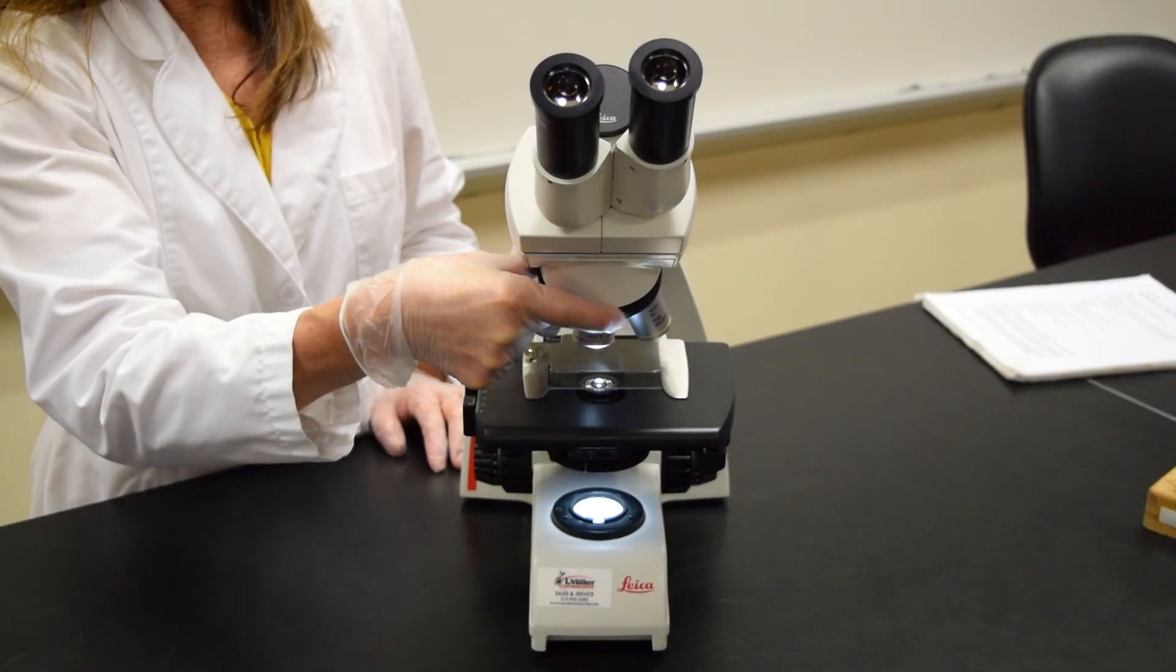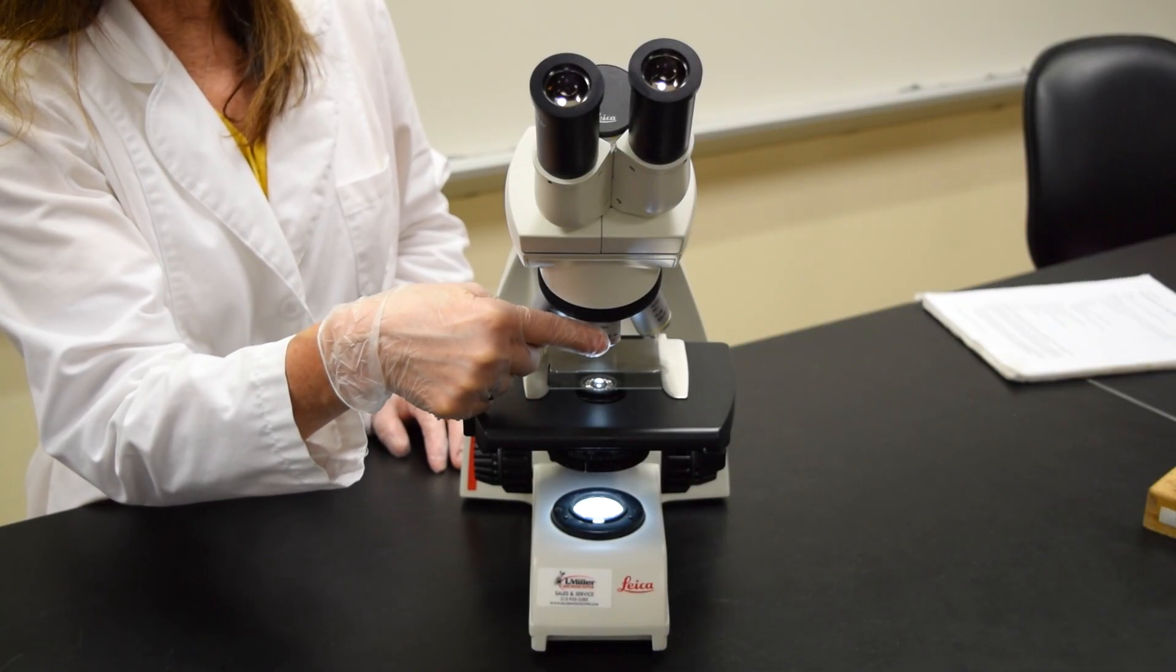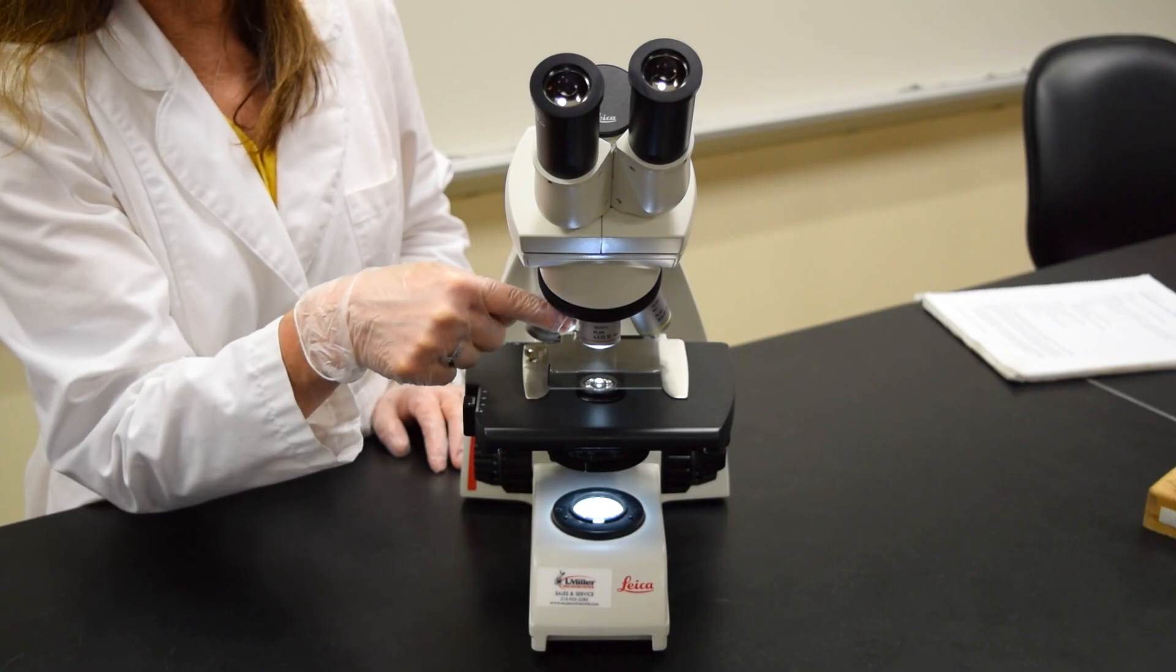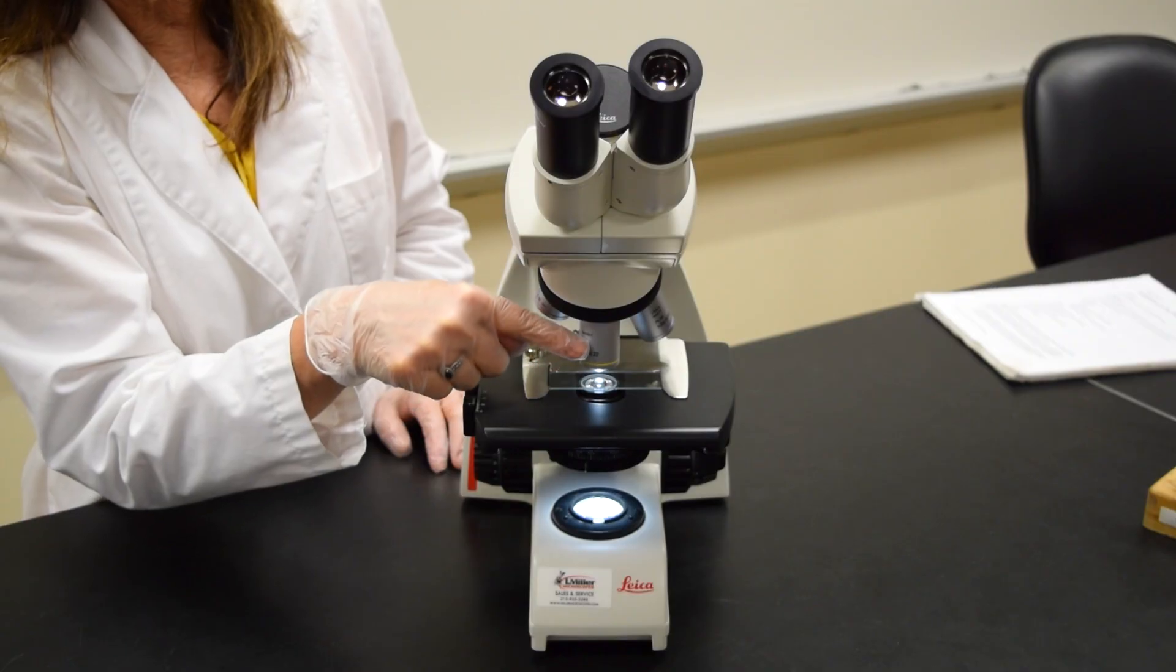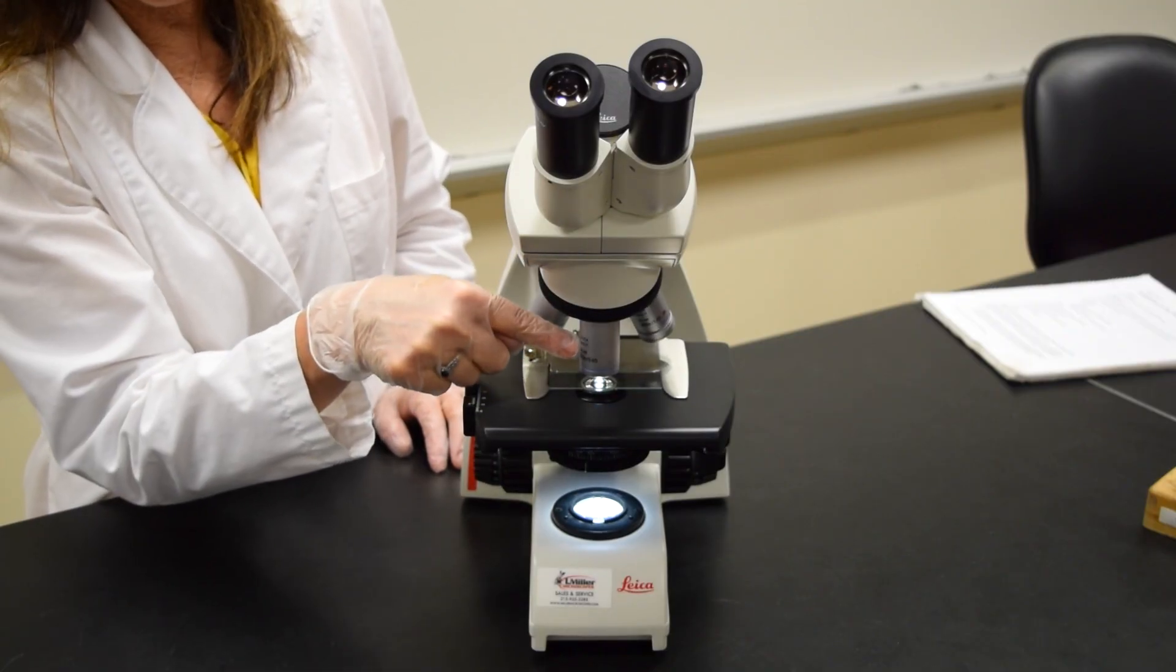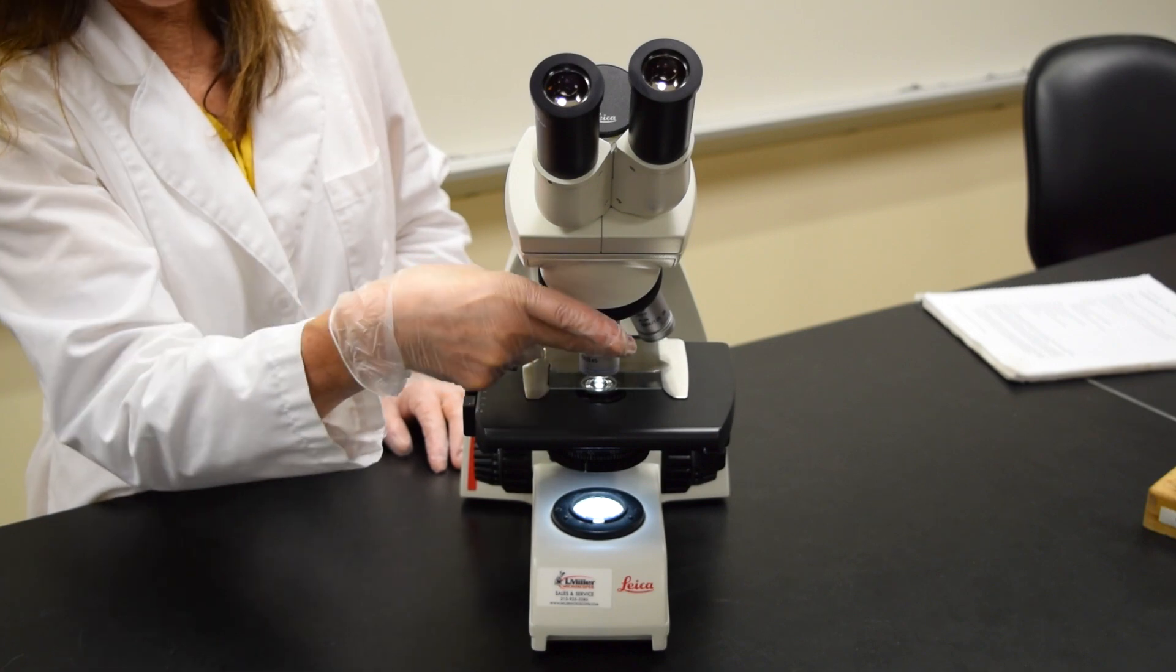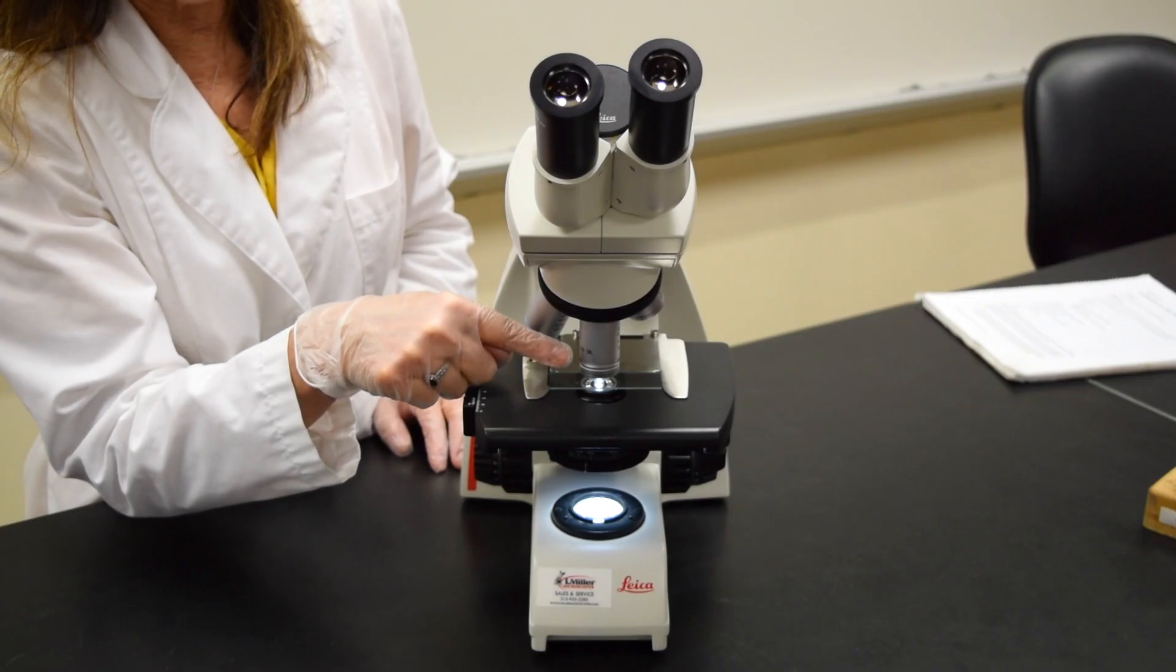We have our revolving nose piece that consists of four objectives. The scanning power with a red color-coded band, the low power objective with a yellow color-coded band, the high power objective with a blue color-coded band, and then finally, the oil immersion lens with a white color-coded band.